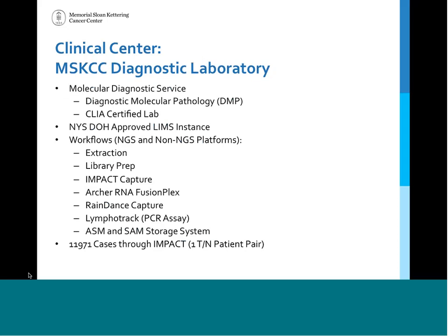And the LIMS instance used by this lab is approved by the New York State Department of Health and is subject to their strict and rigorous guidelines and checks. They have a number of workflows that are both NGS and non-NGS platform-based, listed here.